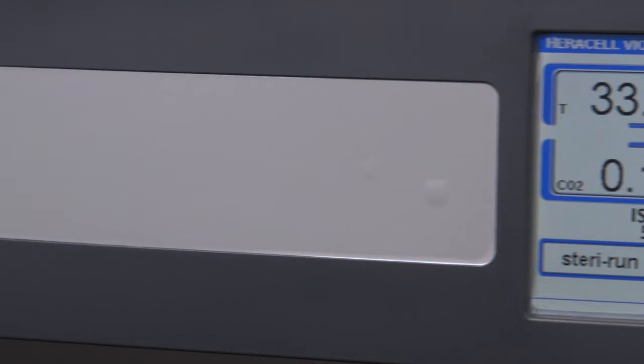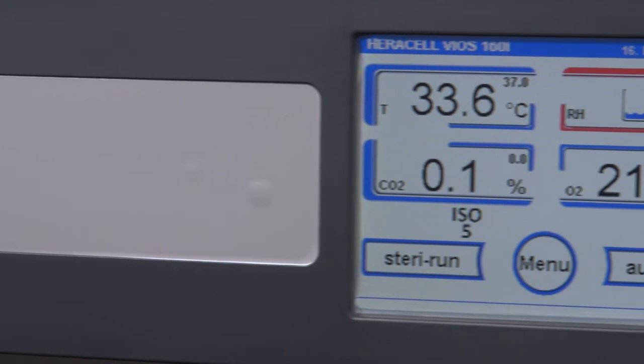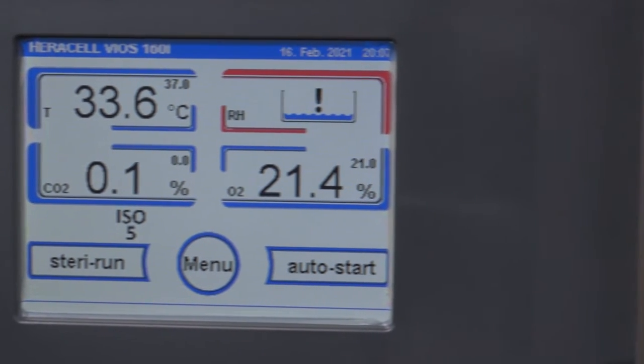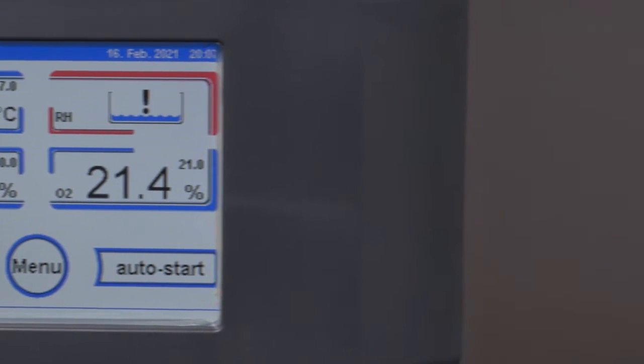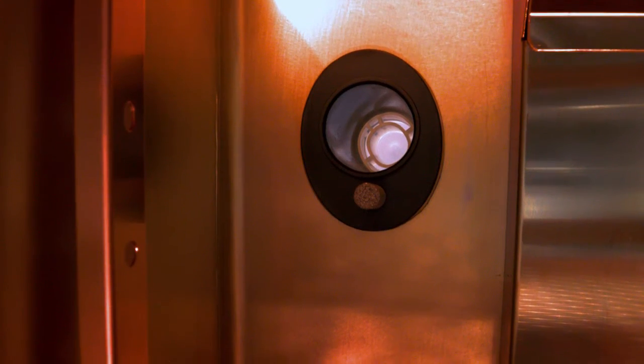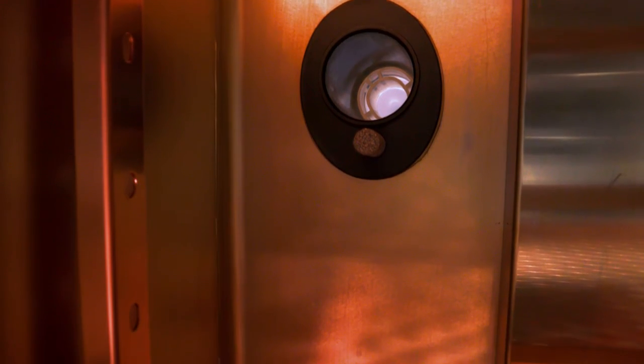And this system is operational during standard operation at 37°C and then also during the high heat sterilization cycle during steri run.